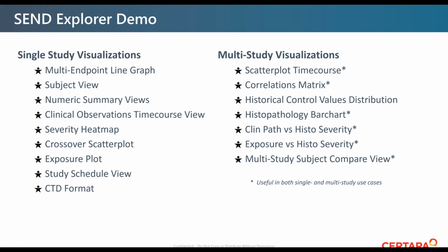So I'm going to move into a Send Explorer demonstration, and Send Explorer has both the single study and the multi-study visualization capability. I've listed here some of the single study visualizations and the multi-study visualizations that are supported by Send Explorer. You'll notice that there are a number of multi-study visualizations that also are useful in the single study scenario, but they can be extended to multiple studies at once. I'm going to go through a small number of these in the application to give you a taste for what the product does.